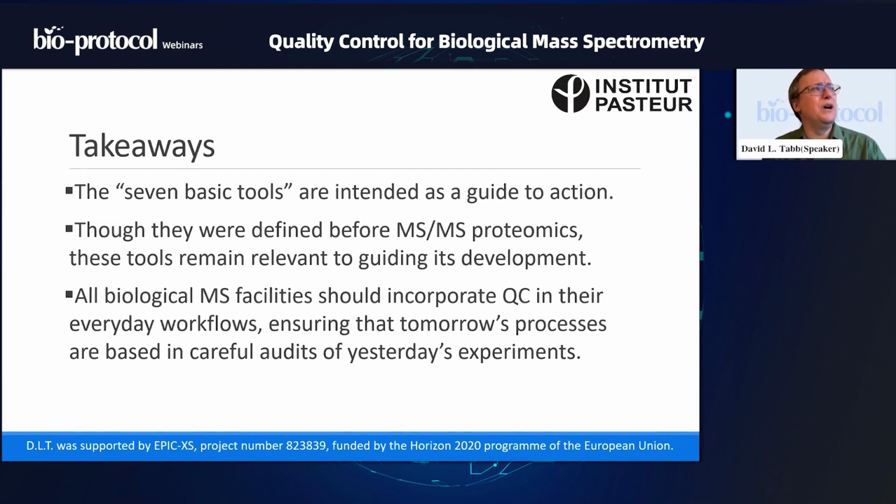What if you simply open a raw file in the instrument control software and say, yeah, that looks pretty good? Have you quantitatively characterized why it was good? Have you said what was the intensity level? What were the retention times like? What fraction were identified? We want to be able to guide action.